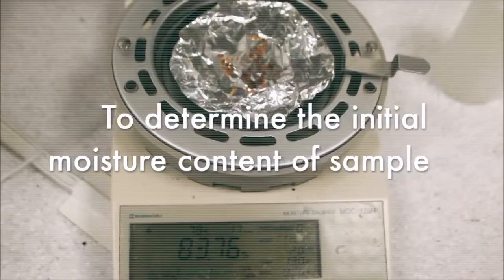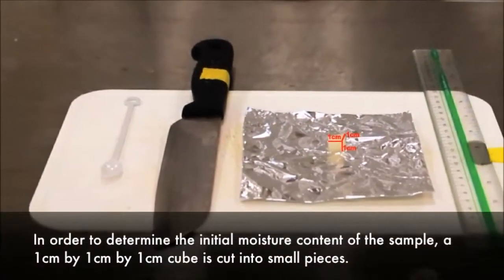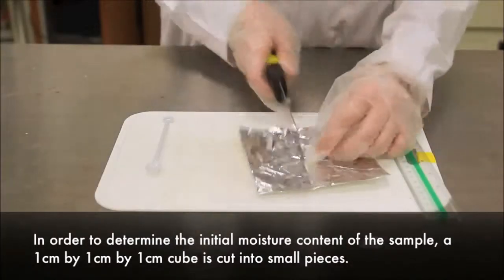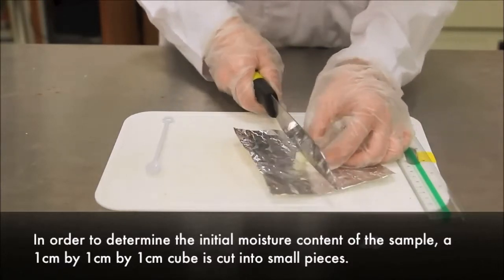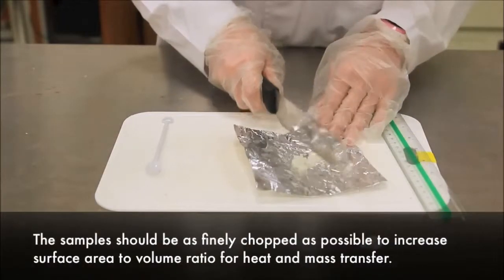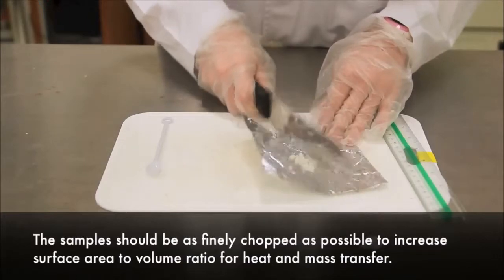To determine the initial moisture content of the sample, a 1 cm by 1 cm by 1 cm cube is cut into small pieces. The samples should be as finely chopped as possible to increase the surface area to volume ratio for heat and mass transfer.